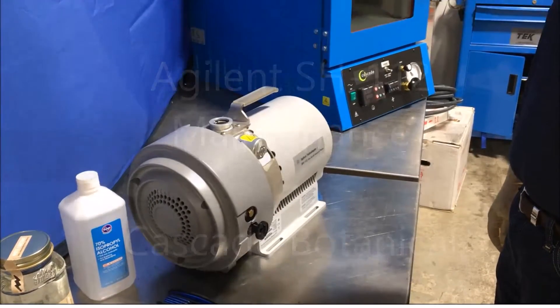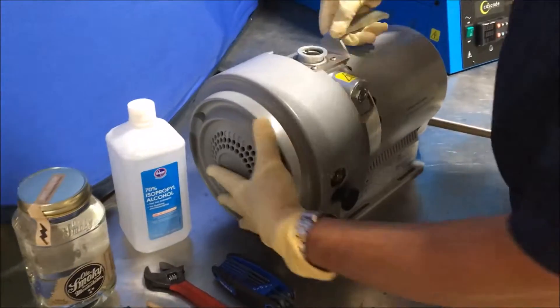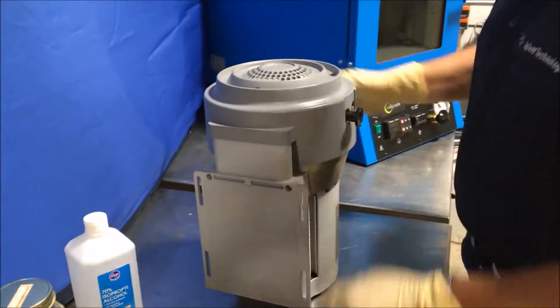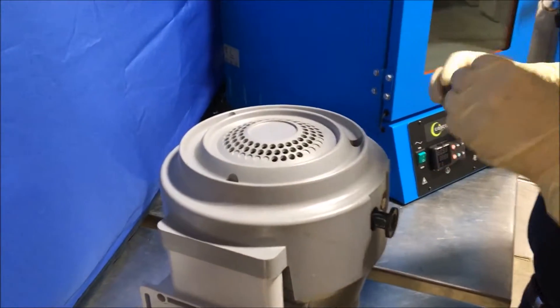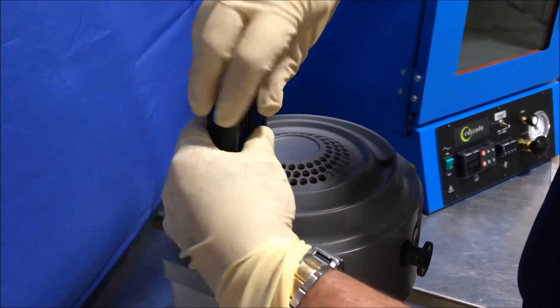The first step for disassembly is to remove the front cowling. Put the pump on the backside and remove the three 6mm hex bolts that hold the cowling in place.